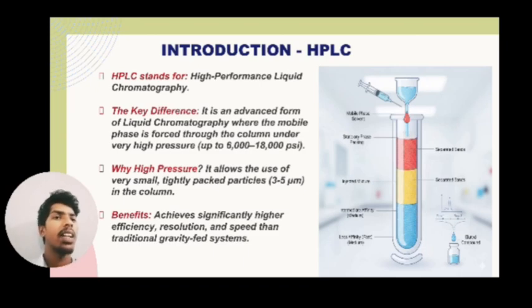Let's observe the diagram. In the diagram: mobile phase solvent, stationary phase packing, injector, mixture, intermediate affinity, less affinity, and separated bands with the red color, yellow color, and lastly sky blue color.